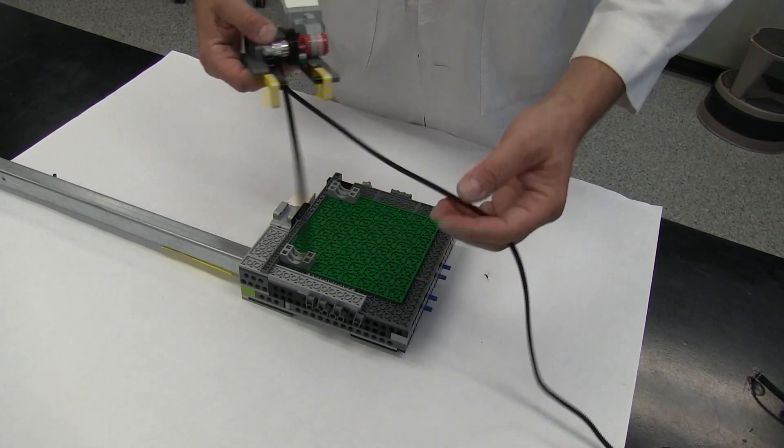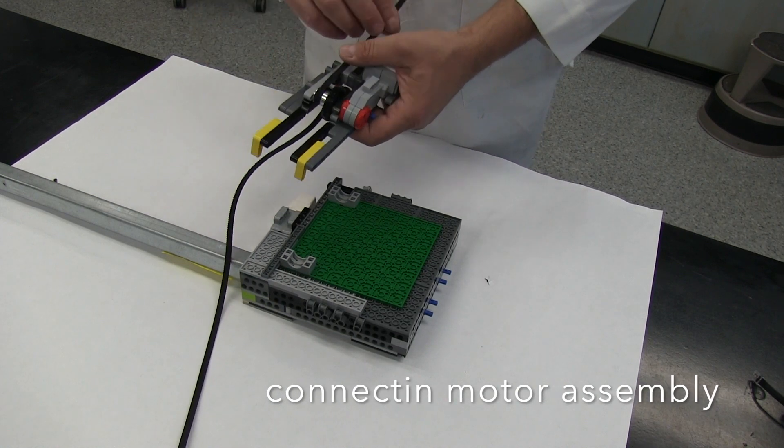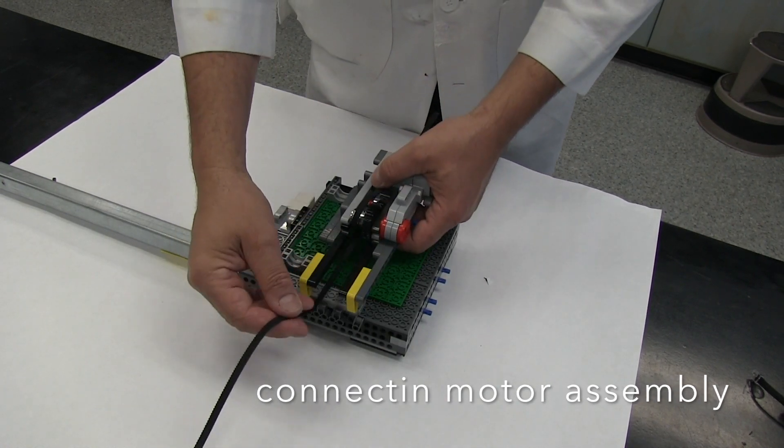Now we will install the motor assembly unit with belt into the robotic arm by connecting the motor assembly unit to the casing.